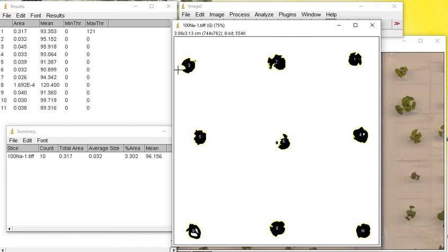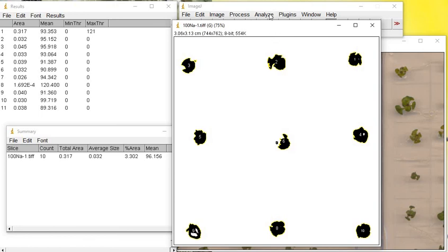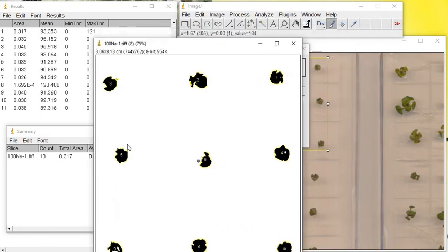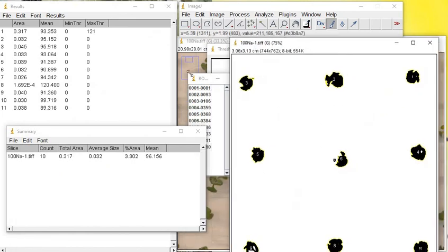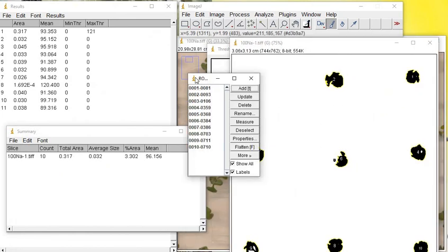If you need to take the surface area or the rosette area of individual plants, you can use this Analyze Particles function. Or else, if you need to just take the overall surface area, you can just use the Analyze function.